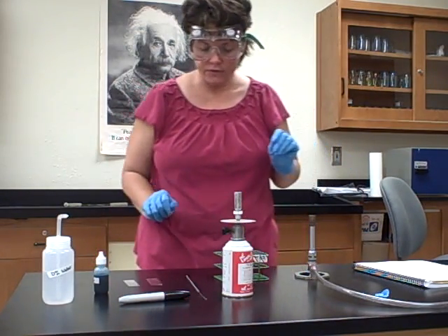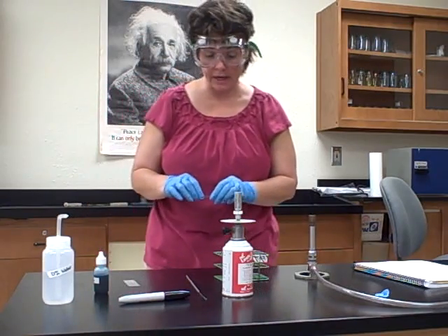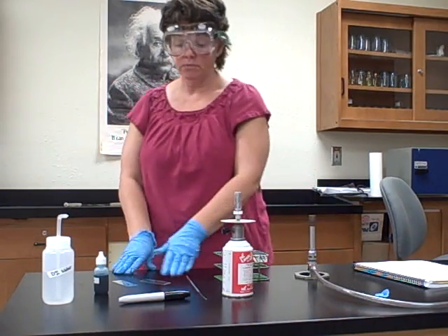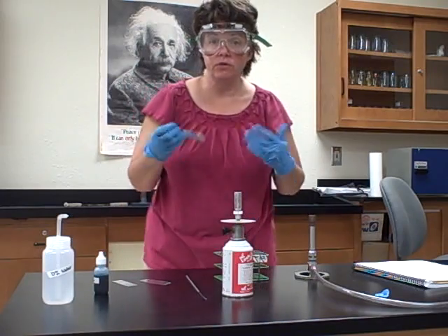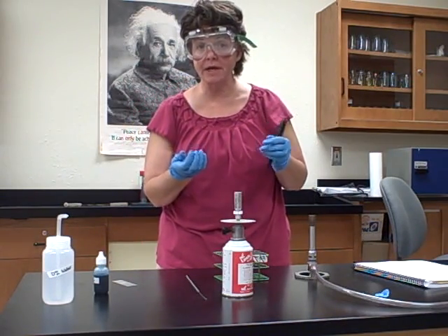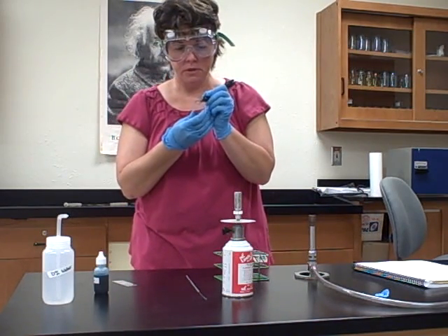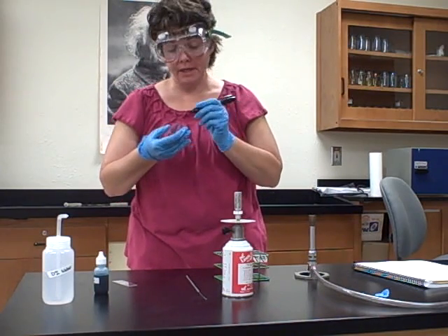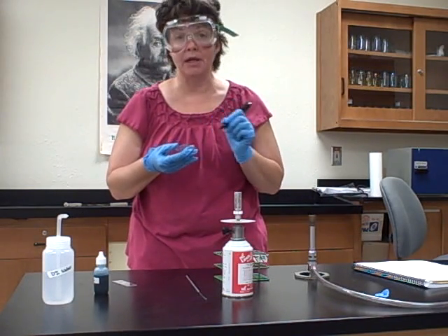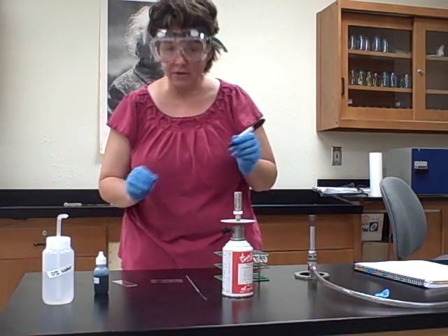The first thing we want to do is prepare our slides. In this experiment we have two different bacteria to put on a slide. We can put them on individual slides or, as shown in the procedure, put two on one slide. To make sure you know which is which, label the bottom of the slide — because when you wash off the front, you don't want the marker to wash off. Draw circles where you're going to put your bacteria and label them. One is Bacillus megaterium and one is Staph epi, so I labeled one B and one S.